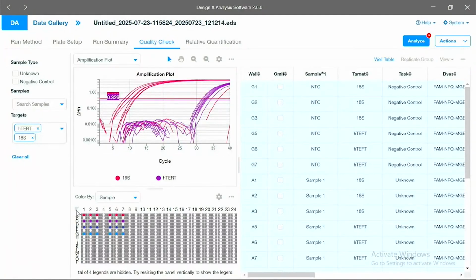So it doesn't make sense to lump all of the data together, but more separately and individually. All right, so ultimately, all of this data we're going to keep. If you want to exclude some, that's pretty straightforward. You can omit them and then reinitiate the analysis. Straightforward. All right, what's next?